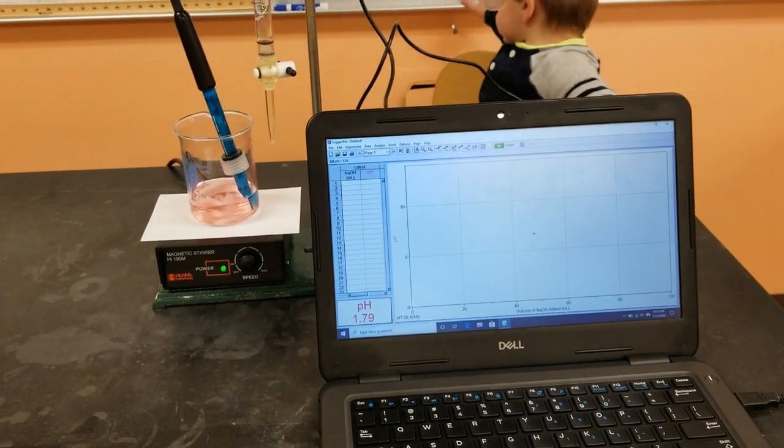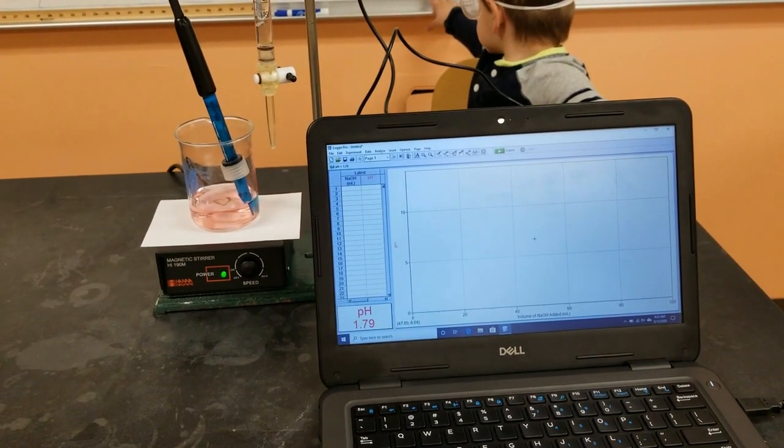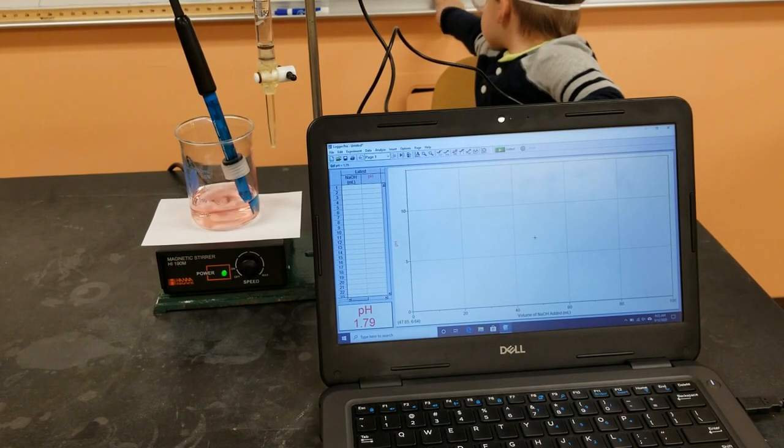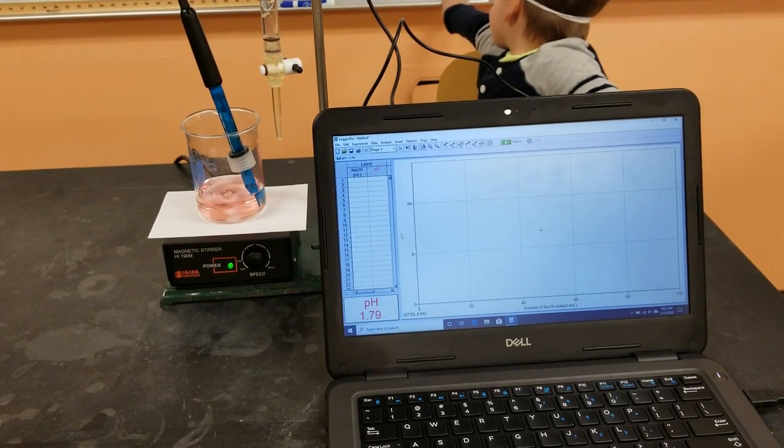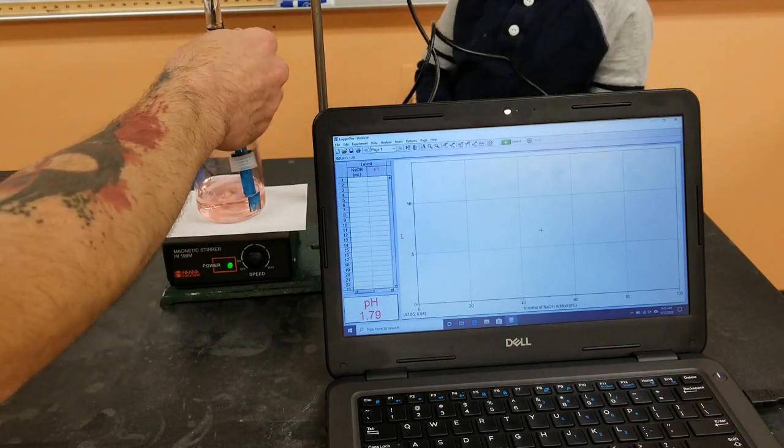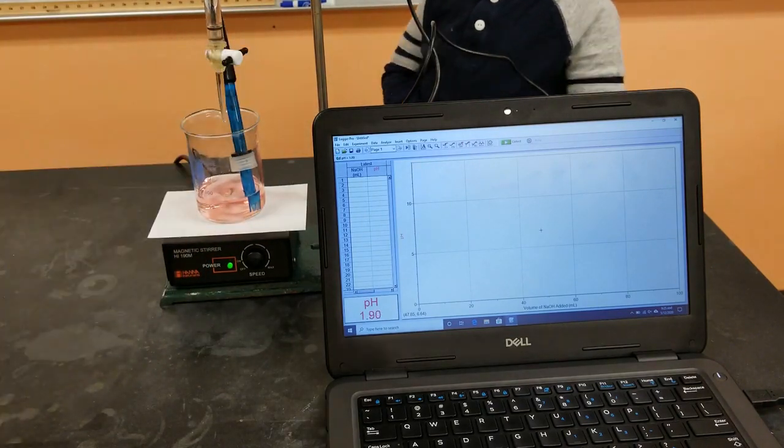And so what I'm going to be doing is adding base, dropping the base until the pH changes by 0.1 or 0.2 each time, and then keeping that point.